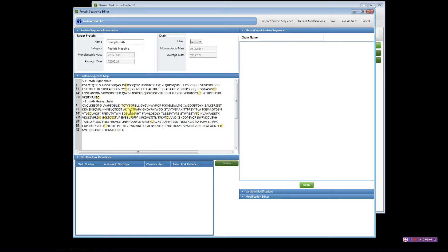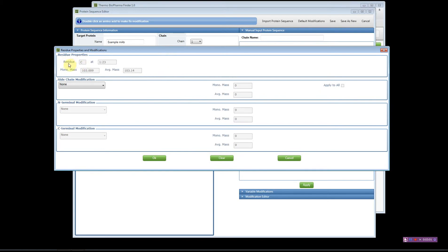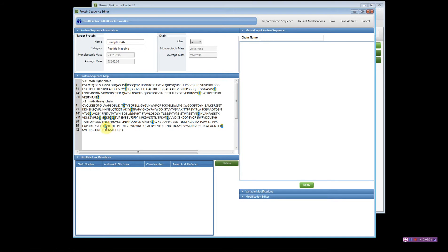To add static modifications, simply double-click on a residue. Place your cursor to the left of the residue and double-click. This dialog box will appear and it is residue-specific — since I clicked on a cysteine, the residue highlighted is cysteine. I have side chain option modifications available because this is not the N or C terminal, so I can select from the list and pick a modification.